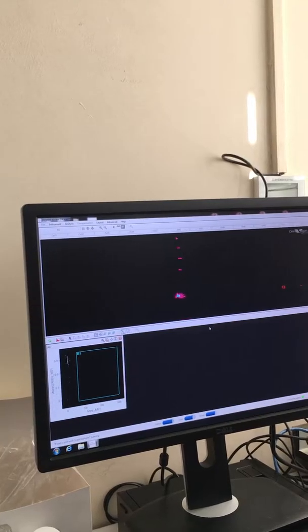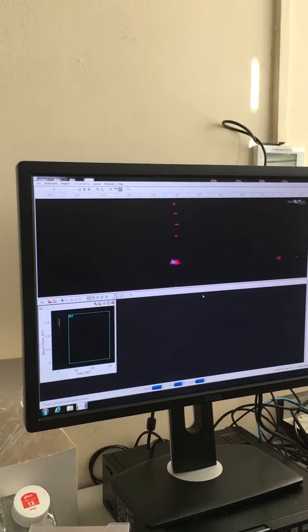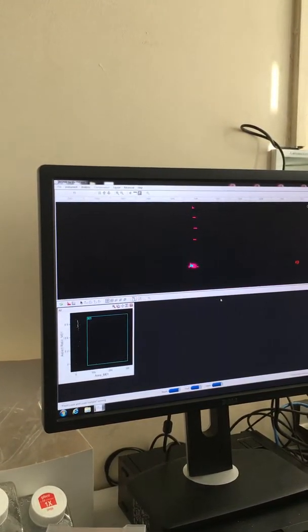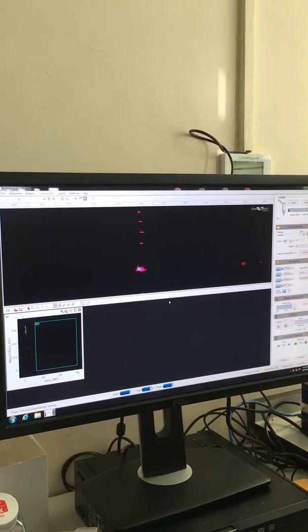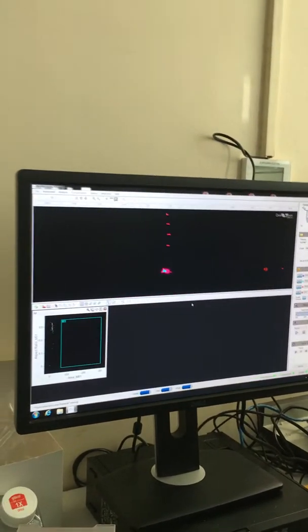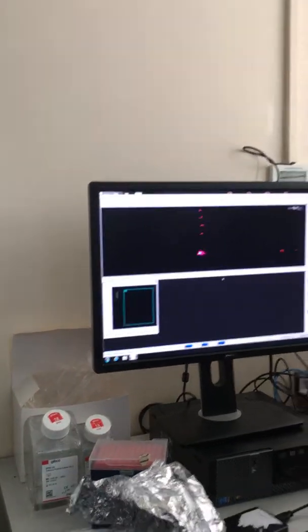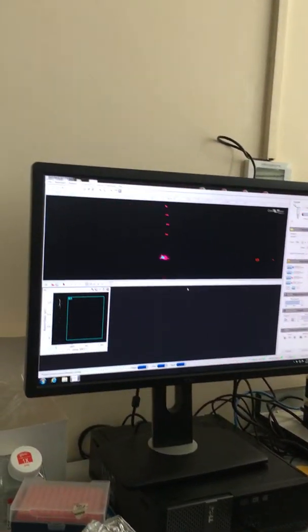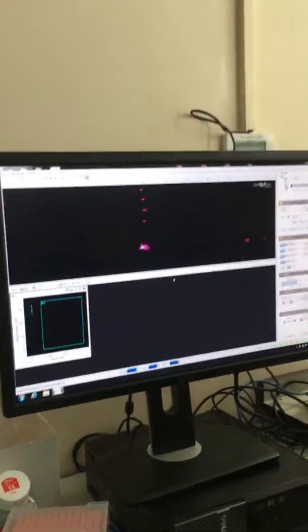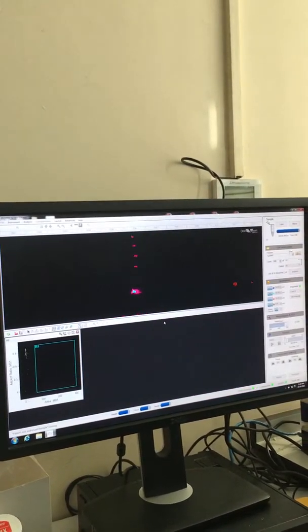I have a load of cells here, and you should have loads, yeah. Seeding like 1 million per well gives you easier analysis. Or if we did 100,000 like the original protocol said, we'd have too little to run this properly, and it would take longer. There you go, so you've got 46 microliters.